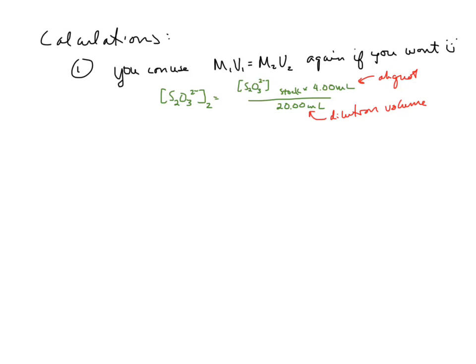So in this case, you just need to get the molarity of the thiosulfate off of the bottle. So that's the molarity of the stock. You're using 4 mL aliquots, okay, each time of that. By the way, over there I have the standard pipette bulbs out, so pick your favorite pipette bulb, and then I have the graduated pipettes to use.